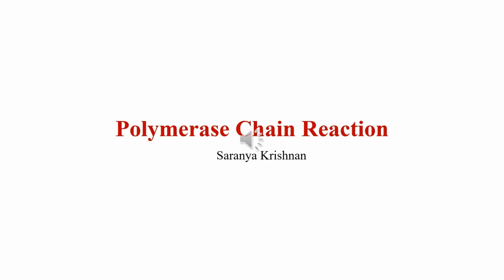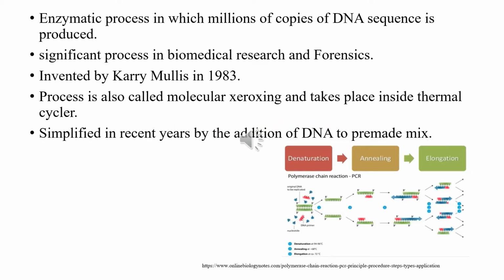In this presentation, I am going to talk about polymerase chain reaction or PCR. Polymerase chain reaction or PCR is an enzymatic process in which millions of copies of a particular DNA sequence can be produced. It is a significant process that can be applicable in both biomedical research and also in forensics.